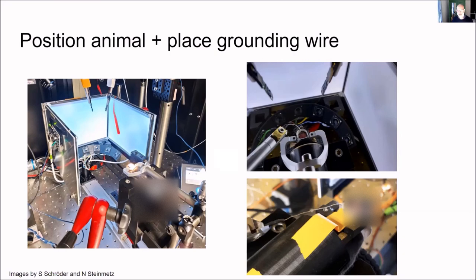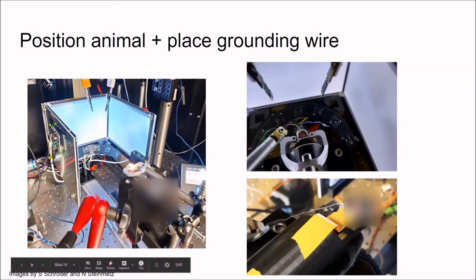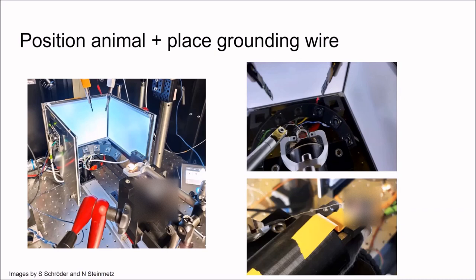Once this is all in place, then you position your animal and place the ground wire. I just want to show we have this kind of nice setup here where you can place the animal into the head holder. But the whole stage where the animal is sitting is sitting on these rails. So you have a lot of space placing the animal and then you can just slide the whole stage under the probes. Here you see the animal is under the probes. You can place your ground wire into the well. These are the probes on top. Here you see it a bit better, the ground wire. And you want to have the ground wire really out of the way for your probes, giving you much space to place the probes.